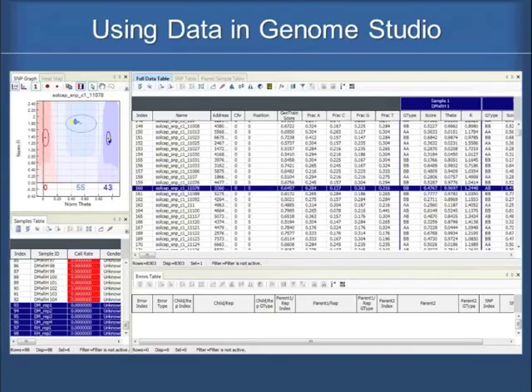So now he's taken these 3 data files, imported them into Genome Studio. And so this is a screenshot of Genome Studio here. Over here, where I have this circle, if we were to expand this window of information, all the way going out to the right would be all the progeny.